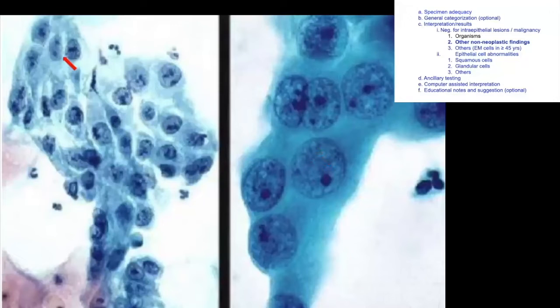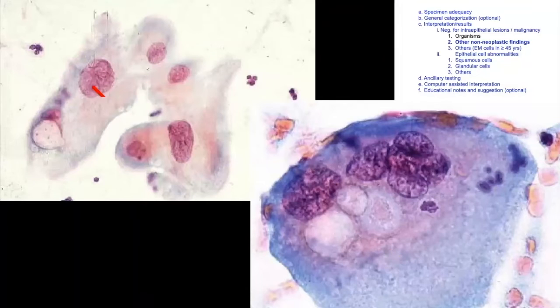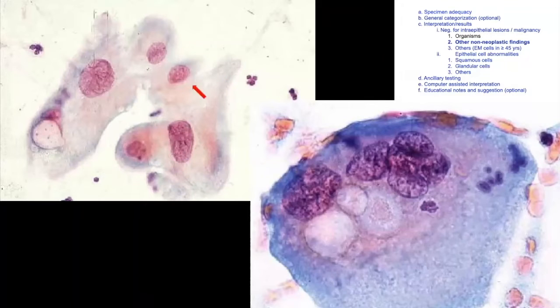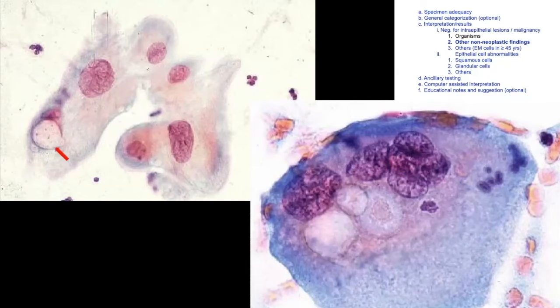Another very important feature of repair and regeneration: maintenance of polarity — the cells are all running in one direction even though nucleoli are present and chromatin is coarse. This maintenance of polarity is very important. Here the cells are enlarged, reddish as well as greenish, showing cytoplasmic vacuolations, and even one nuclear vacuolation. The nuclei are enlarged but the cytoplasm is also enlarged — maintenance of nuclear-cytoplasmic ratio. The key features are: two-tone appearance (two colors in one cell), multinucleation, and degenerative vacuolations — all features of radiation effect.